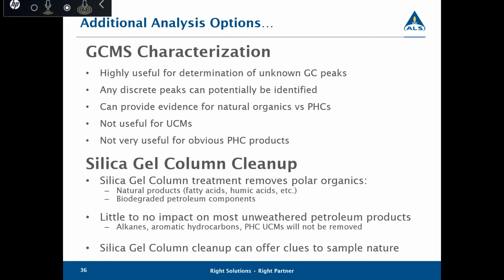Petroleum hydrocarbon UCM will not be removed, so it will still be present. So the silica gel column cleanup can offer clues to the nature of your sample. How it works is the treated and untreated samples get analyzed and the results get compared. Based on that comparison, it can be determined if the majority of the components in your sample are polar or non-polar. So basically that's how it works.